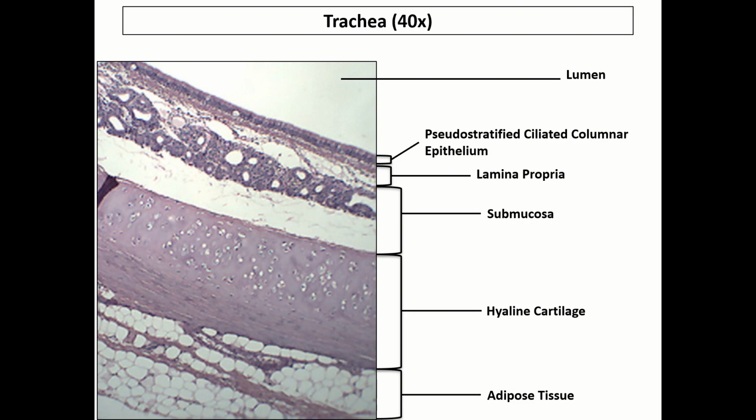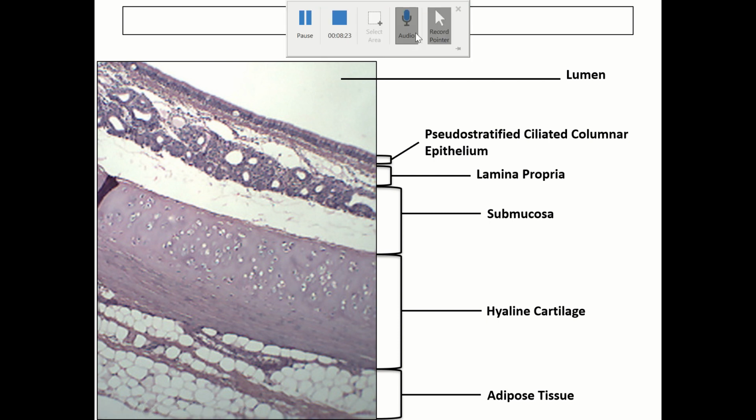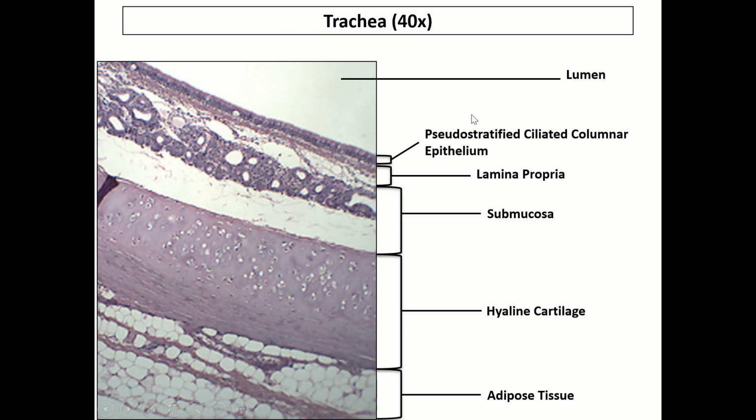As you continue on, you see the next type of epithelium, and this is going to be referred to as pseudostratified ciliated columnar epithelium. Now, the slide you're going to use to see this is titled the trachea and the esophagus. So look within your slide boxes to see the correct slide. If you're viewing the trachea and the esophagus slide, you're going to have both organs on one. Be sure that you're focusing on the trachea to see the epithelial tissue that we're studying at this time.